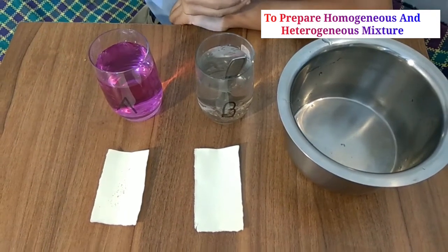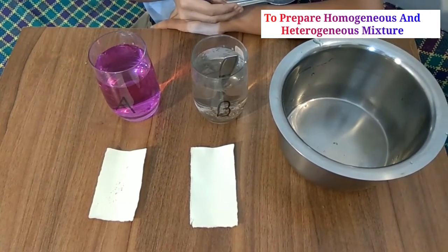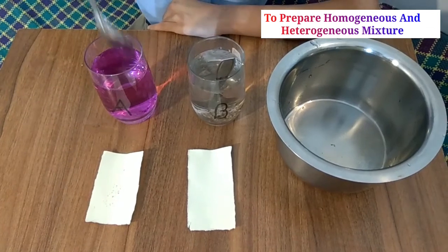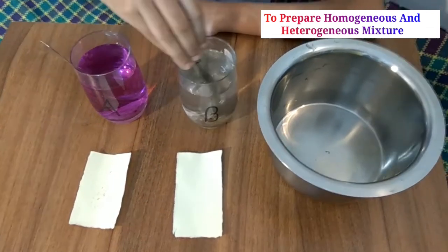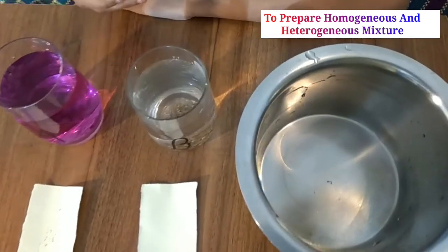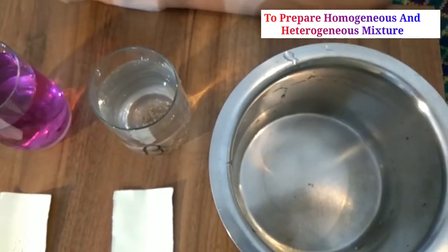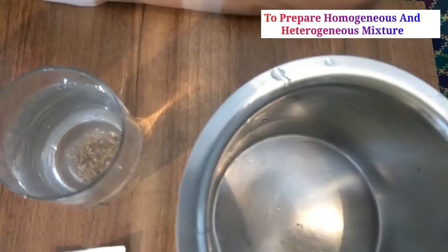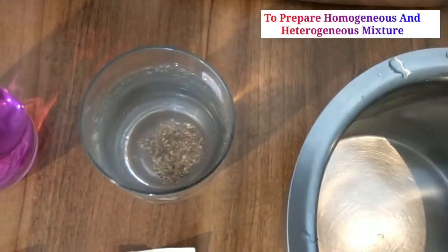Observe in glass B: when we stir, the sand moves for a while, but after some time the sand settles to the bottom and doesn't dissolve. That means the mixture of water and sand is a heterogeneous mixture.